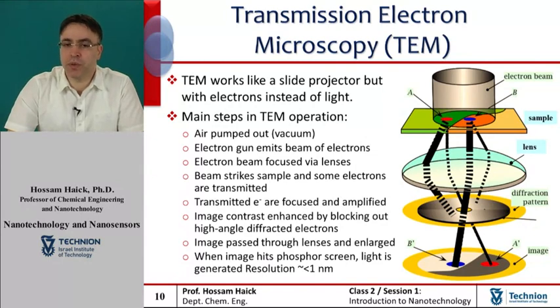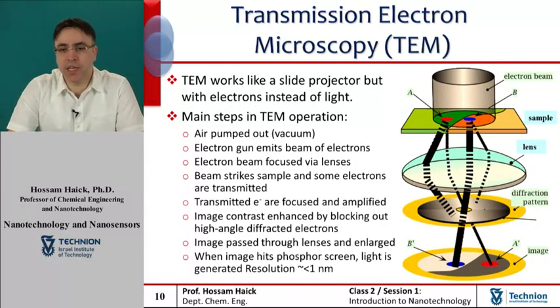Transmission electron microscopy, usually abbreviated as TEM, is a microscopy technique that enables the instrument's user to examine fine details, even as small as a single column of atoms, which is tens of thousands of times smaller than the smallest resolvable object in a light microscope.